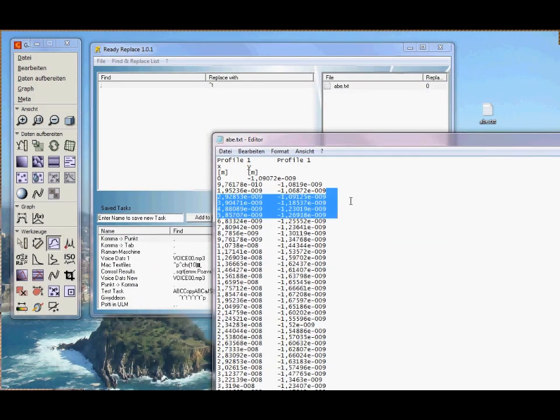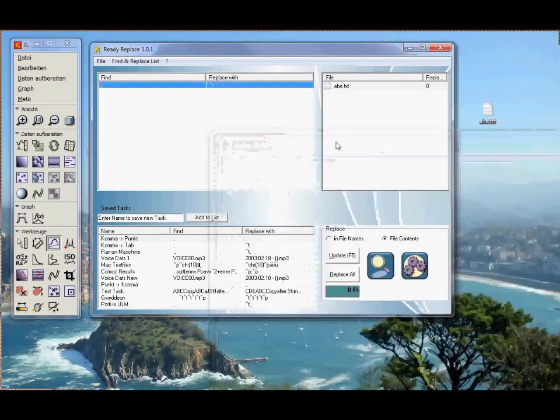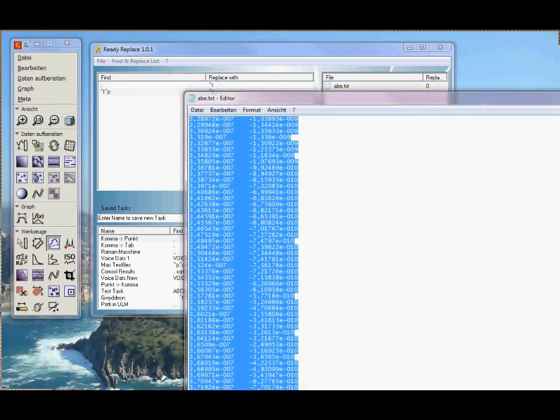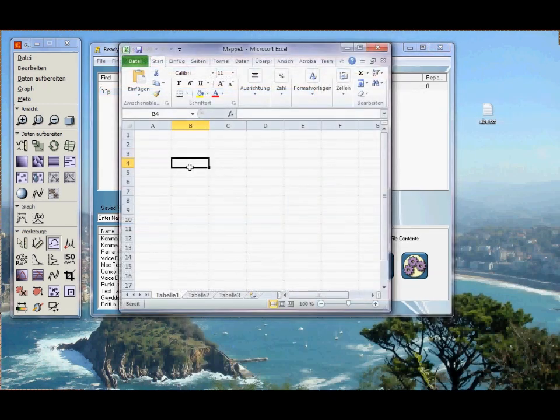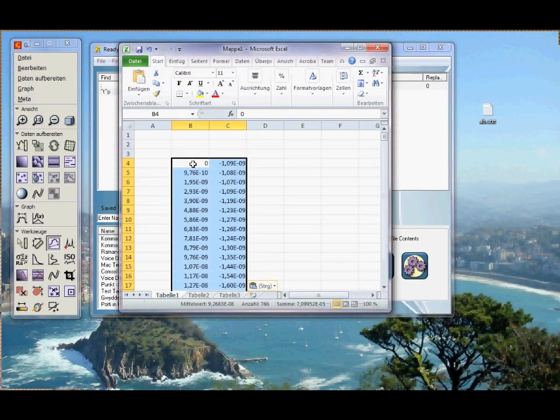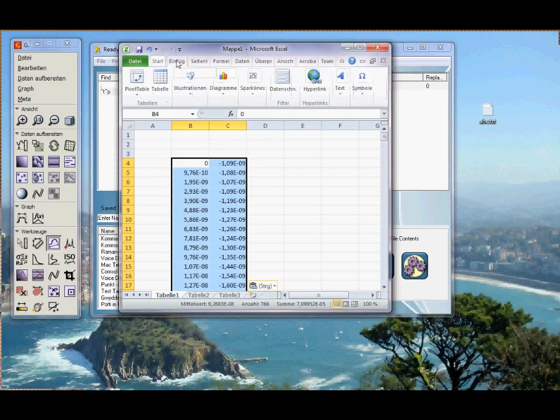All the semicolons are replaced with a tab and you can easily insert the data into Excel. Copy the text and paste it into Excel. Since the values are separated by tabs now, the values are going to two columns.